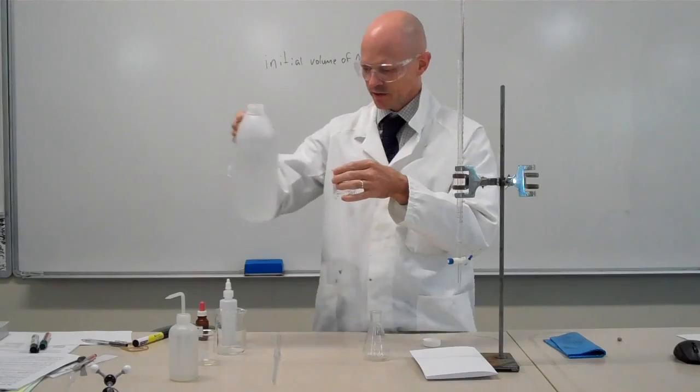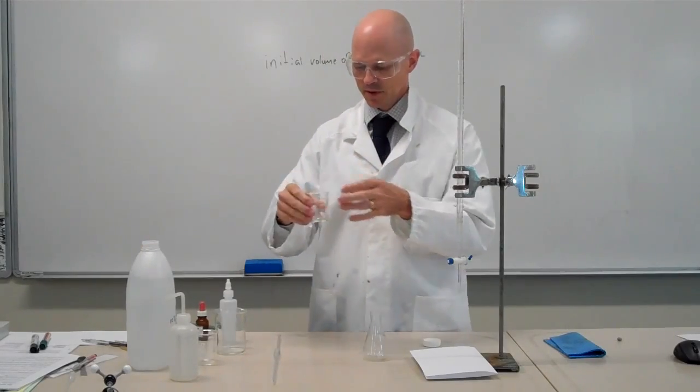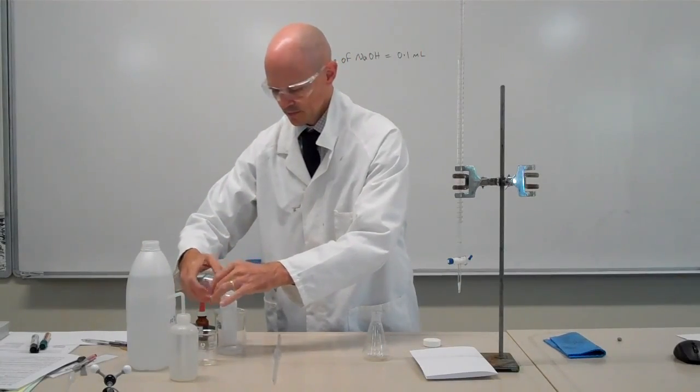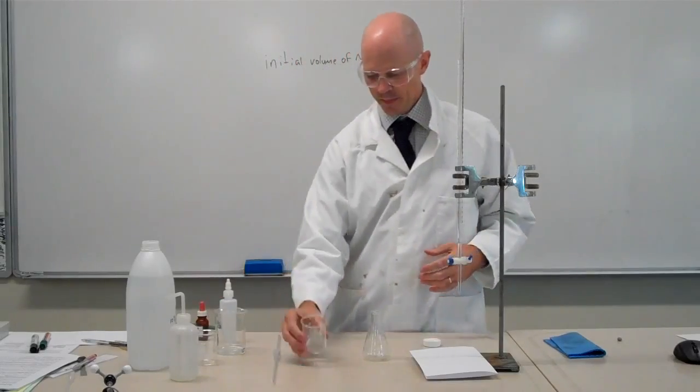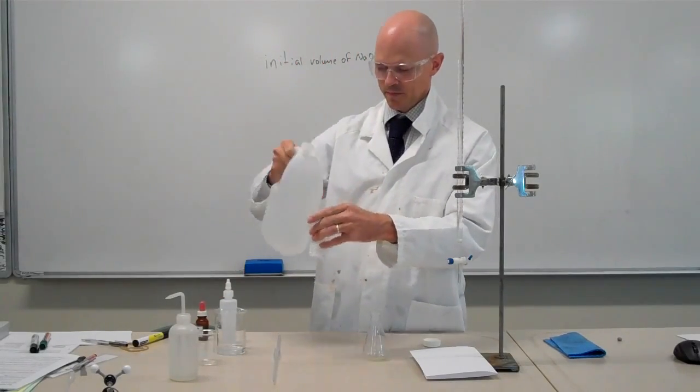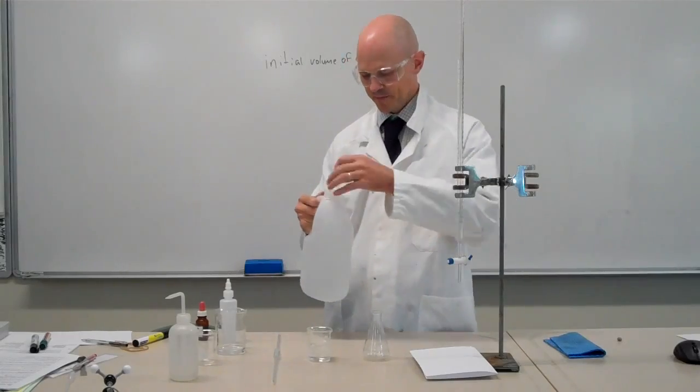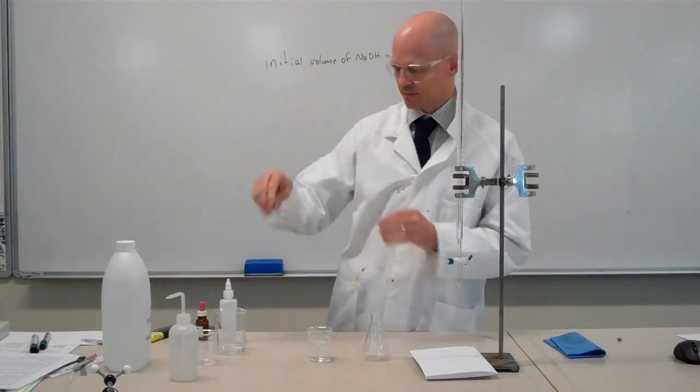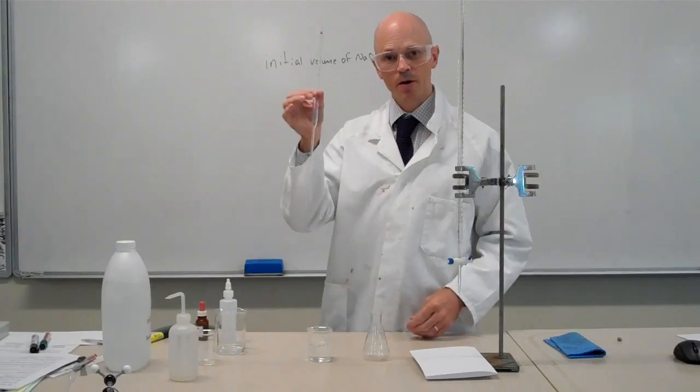So I'm going to pop a bit of my vinegar into my beaker here and just wash it out. Put some more vinegar in there. And I'm going to pipette out 10 ml using a bulb pipette.